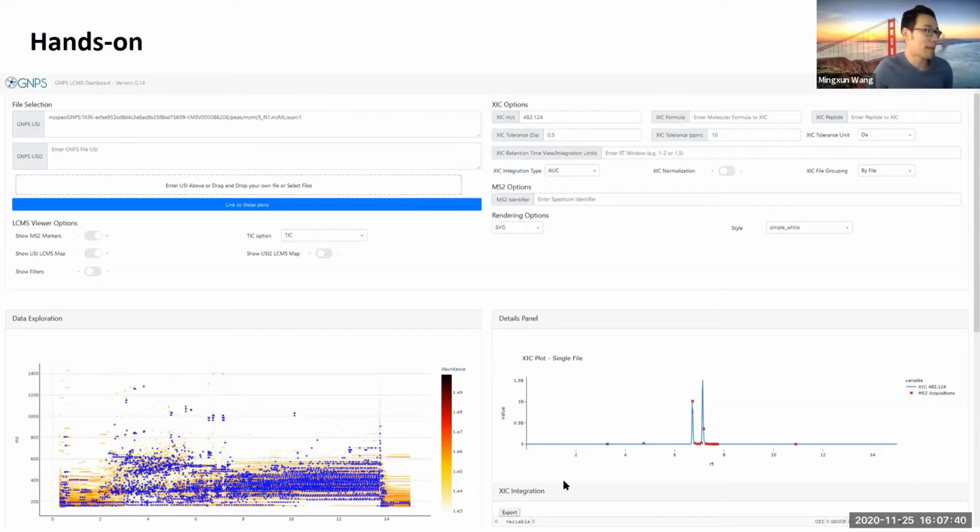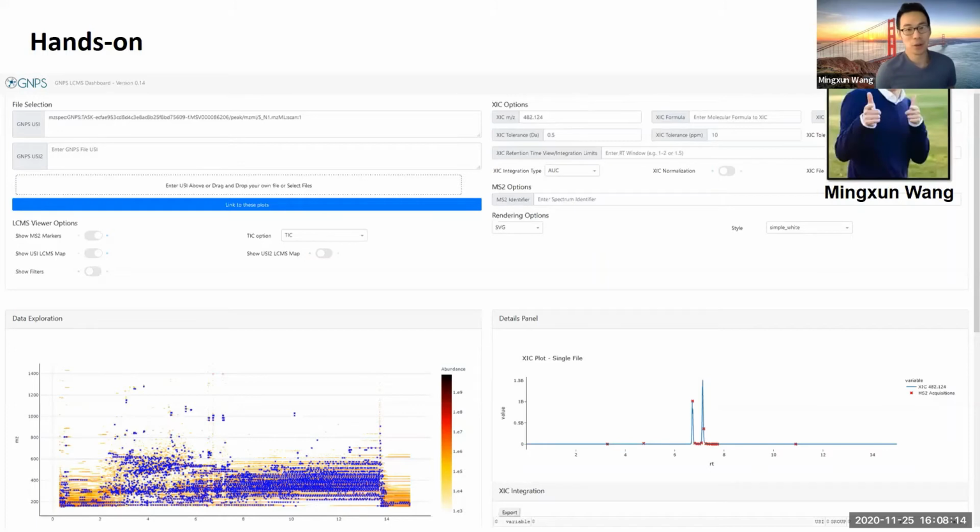What we can see in this bottom right panel is the XIC of that particular molecule. One of the interesting things about it, and Danny can speak more about the analytical chemistry portions, is that you can see two distinct peaks here, which seems to indicate that there are two isomers of Yersiniabactin that could elute at two different times. But in the actual network you generated, it only appears once, one node, so we think there's only one version of it. This is an artifact of classical molecular networking, which only looks at MS/MS and doesn't care at all about the retention time. It's a nice simplifying assumption, but it sometimes oversimplifies. In this case, it missed two different isomers of this molecule.